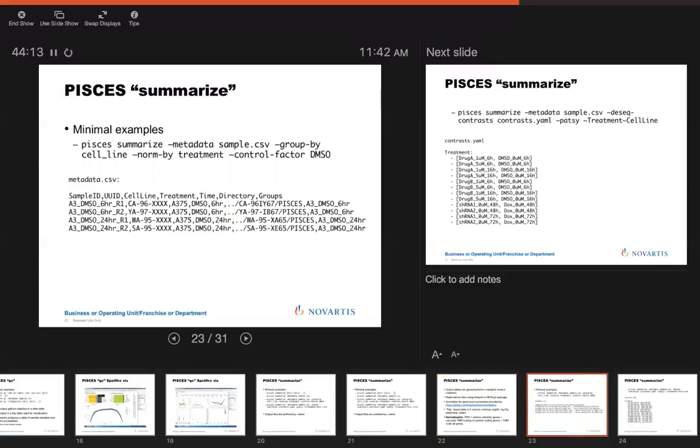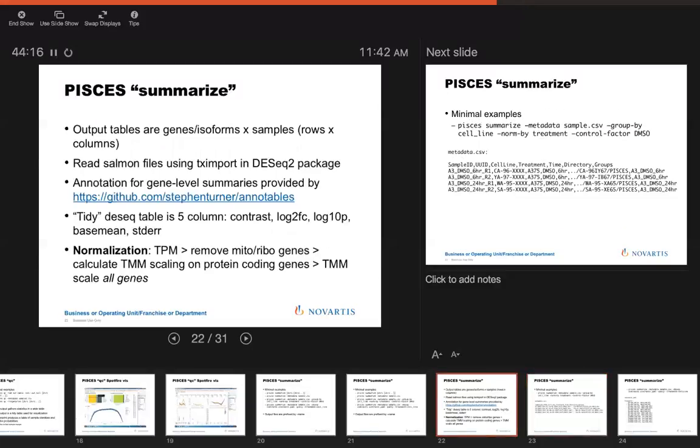Yeah. About mitochondrial stuff. The first is, you're talking about mitochondrial genes or mitochondrial proteins that are coded in nuclear? In this case, both. Yeah, so mitochondrial genes are probably more problematic because you have multiple copies of the mitochondrion. But mitochondrial proteins encoded in the nuclear genome also tend to look funny. I don't really have data to back that up, but they just do look funny.